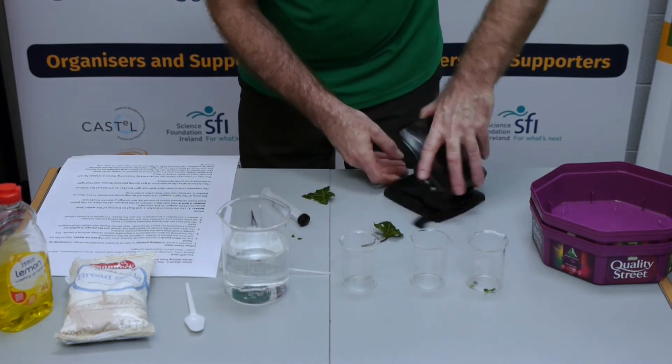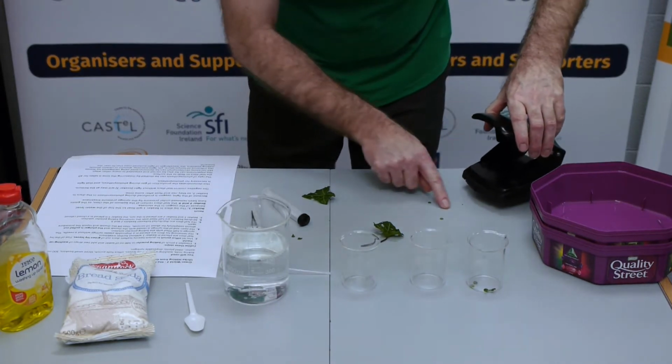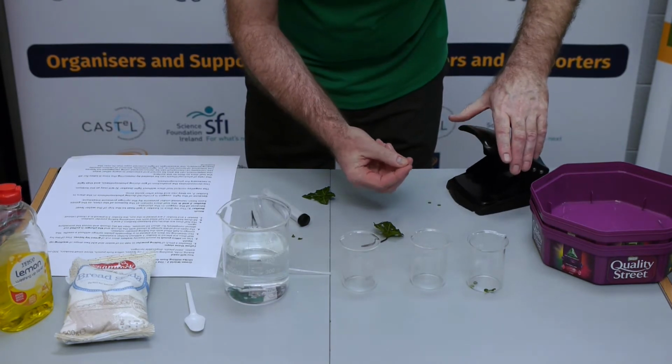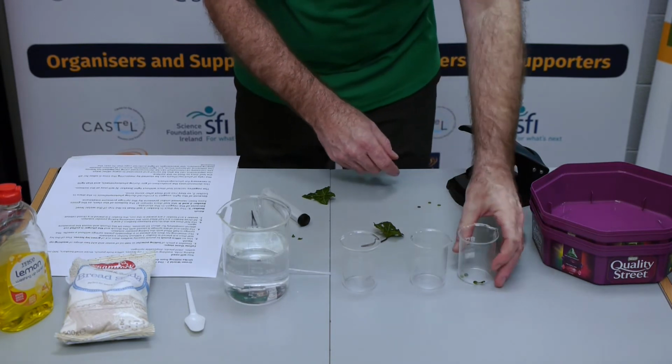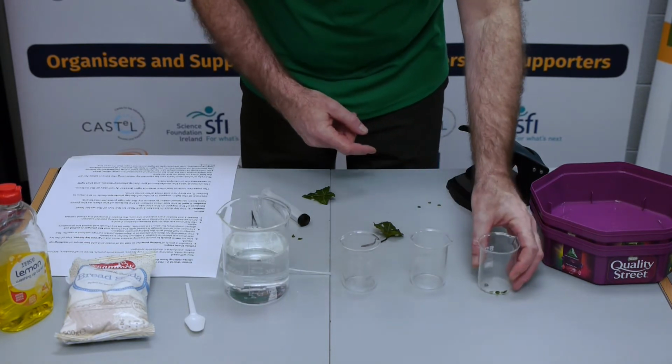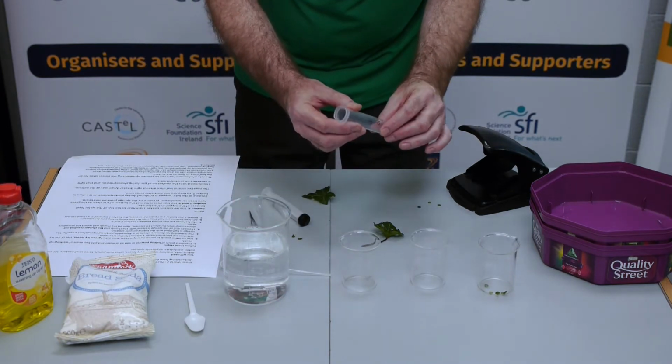And then when you collect your discs from your hole punch, this is what they look like. They're good and rigid. You can punch about 15 of these. I've put 5 or 6 in here. And the remainder, from about 20, I've put in this syringe here.